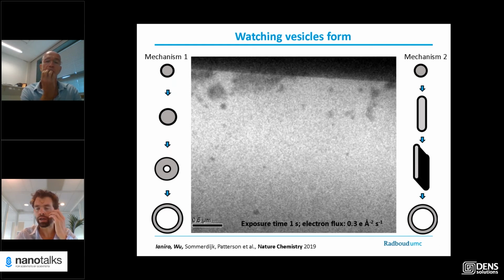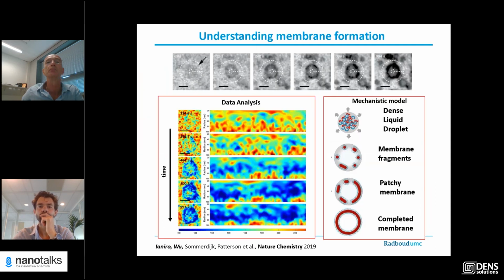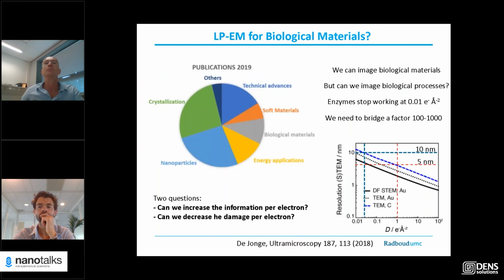Just going to see if Peng-Han Lu is there, and if yes, I see the microphone is working. So welcome. Yes, can you hear me? Yes, we can. Thank you for the very nice talk. This is Peng-Han from UIsh. My question is about the dose budget. There are some opinions in the community saying that the dose budget for liquid phase EM of biological imaging would be a little bit higher than for the vitrified sample. I just wonder what's your opinion, Nico?